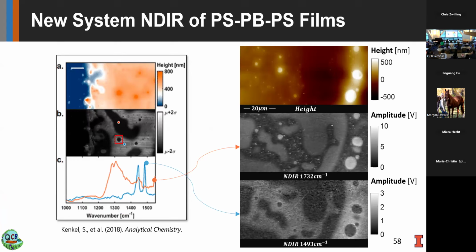Data collected with the new system. Currently, we are losing a reasonable amount of power coupling to the fiber, which I do manually. Some of our electronics aren't up to date, and I can get a lot more gain out of them. And our laser diode, we need to upgrade it to a superluminescent diode to reduce the coherence noise that we're seeing with the deflection laser. All of these effects should boost our performance significantly.